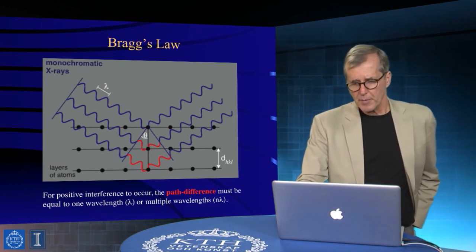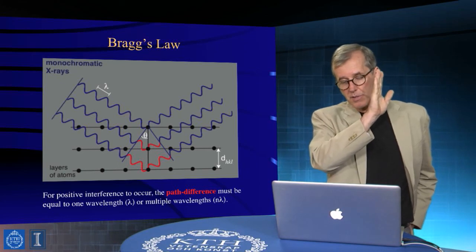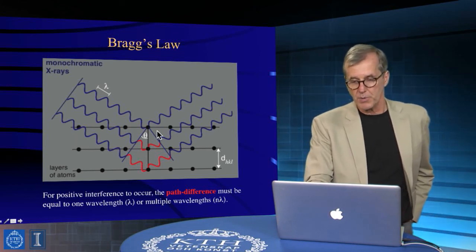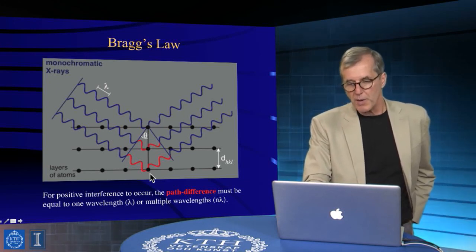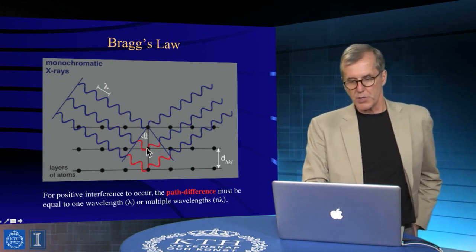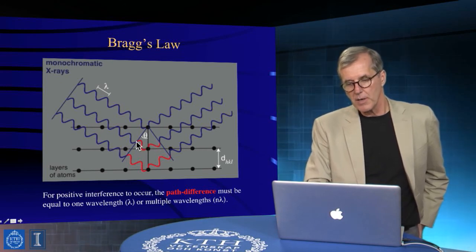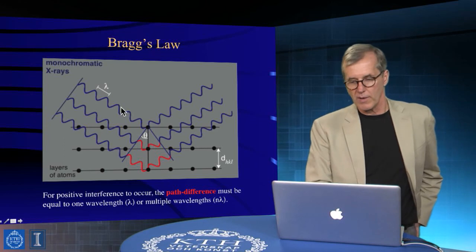And so we can look at Bragg's law from a geometric perspective and think about how it is that this incoming waveform is scattered off of the corresponding periodicities associated with the crystalline habit. And you notice, for example, in this two-dimensional representation, there's a particular symmetry of atoms that are shown, with a corresponding spacing. And an arriving waveform is done in such a way that the phase relationship is maintained the way it's supposed to be. So, for example, you notice the components in red between the arrival at this atom and leaving it, right? As defined by a vector along that particular scattering angle, that's exactly 1 unit of wavelength lambda.